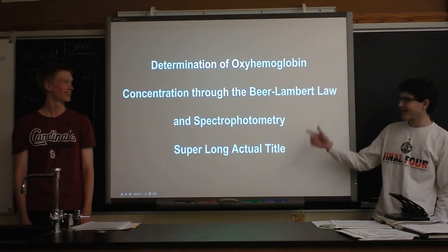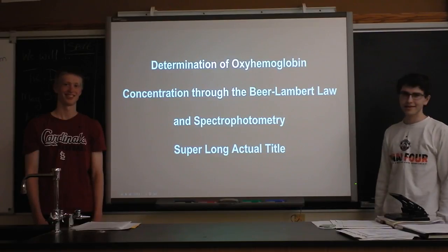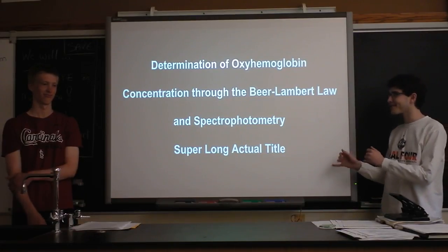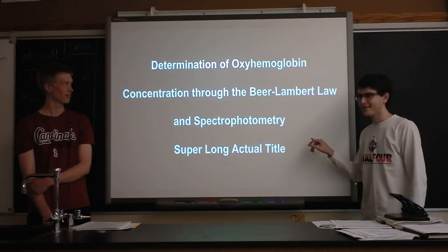Okay, so this is our actual title, and it's really long, so we made a false title page because it's way faster. The title of our project is the determination of oxyhemoglobin concentration through the Beer-Lambert law and spectrophotometry, which is our super long actual title.